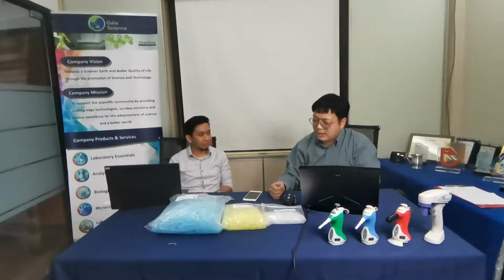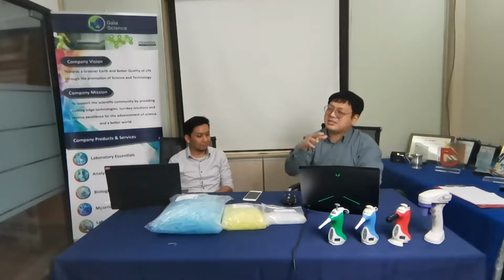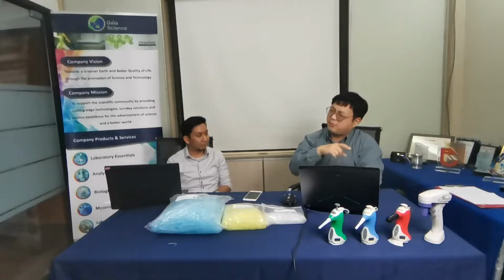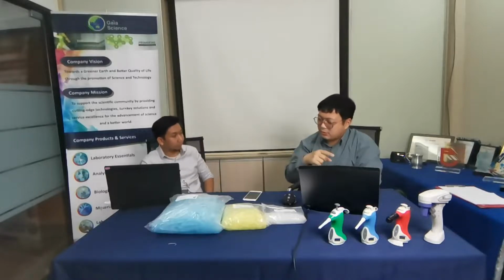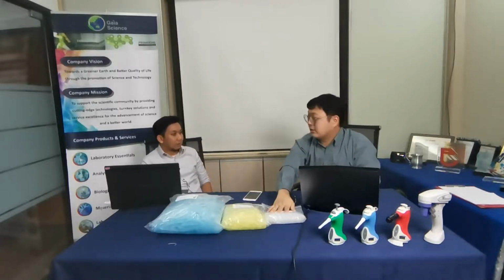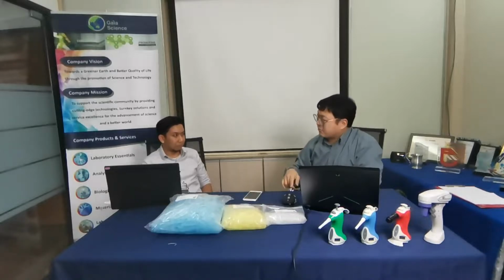Normally, the small white ones come in 10 microliters. That is the standard one, although there are smaller ones. Even if you are working with small, minute volumes, like 1 microliter or 2 microliters, the 10 microliter is fine, actually. Then the yellow ones come in either 100s or 200s.